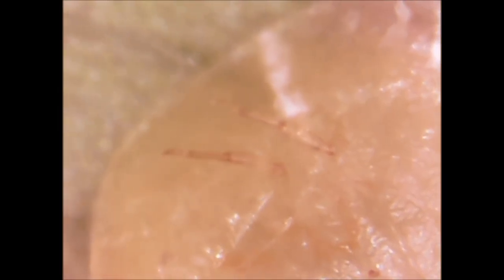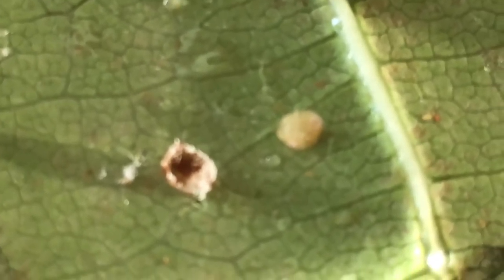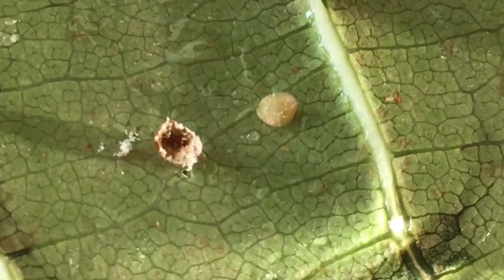It almost reminds me of a skate from the ocean — like a stingray. That shot was just disgusting. This last little piece here is the hard crusty — I'm going to call it scale eggs. This looks like it has been treated before; I couldn't see anything live in here. I tried my best to get a good shot inside. This is either male scale or scale eggs — I don't see anything living, so I'm hoping it's from the last treatment and is no longer alive. This next shot shows just the little tiny area I was working in, with the little ring from where the microscope was — everything we just saw was from this tiny spot.